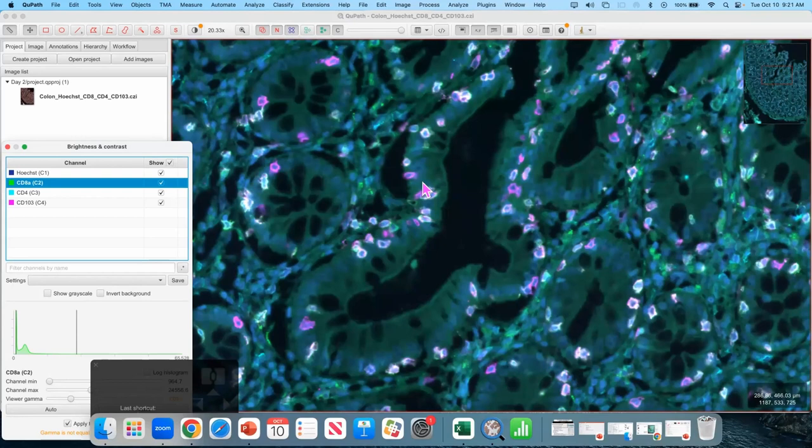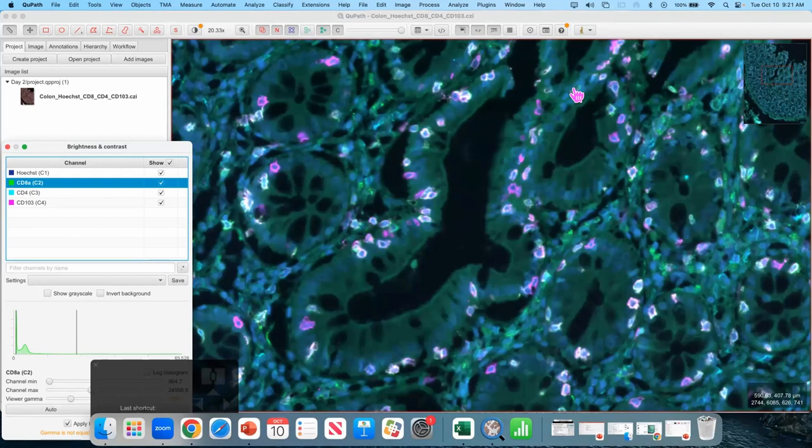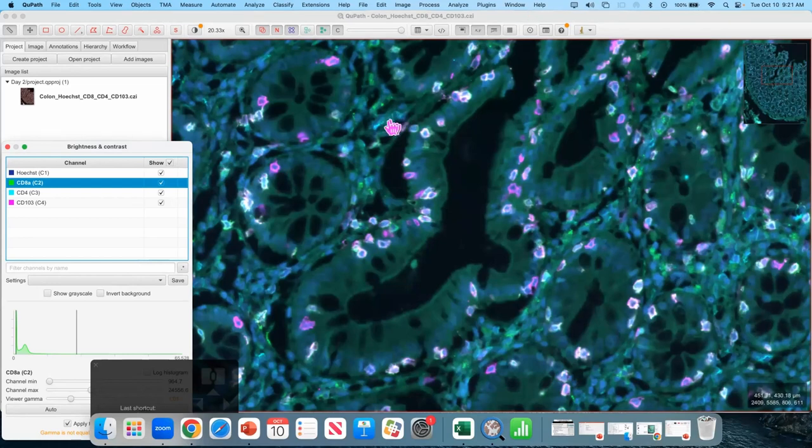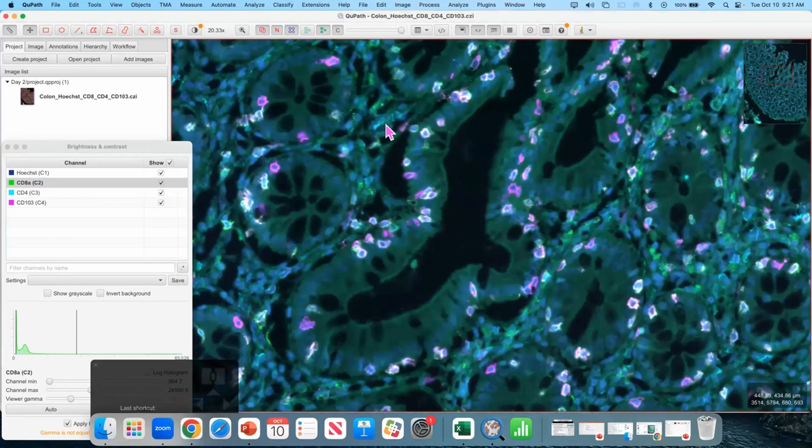So, for the rest of you, CD4s are one type of T cell. CD8s are another type of T cell. CD103, it's a kind of complicated marker. It doesn't necessarily mark, like, exactly one type of cell. I actually usually associate it with dendritic cells and myeloid cells, but it can be found on T cells, too. The immune system does anything it wants at any moment. Can you actually go back to the first step? Yes. So, we're going to segment some cells.